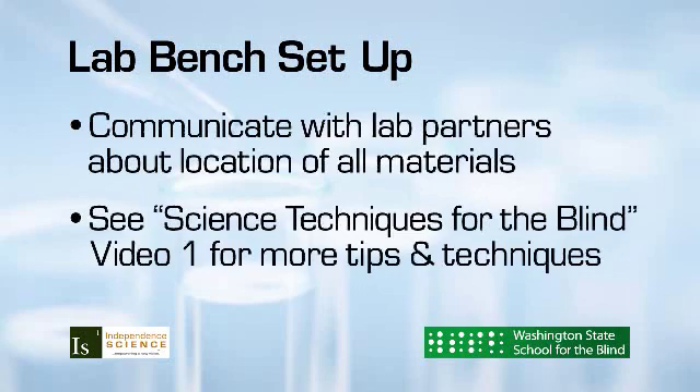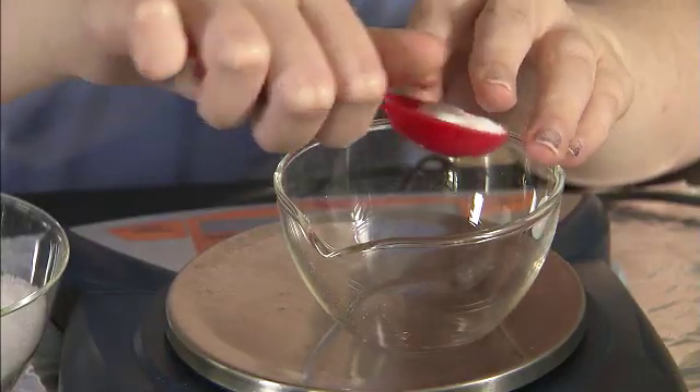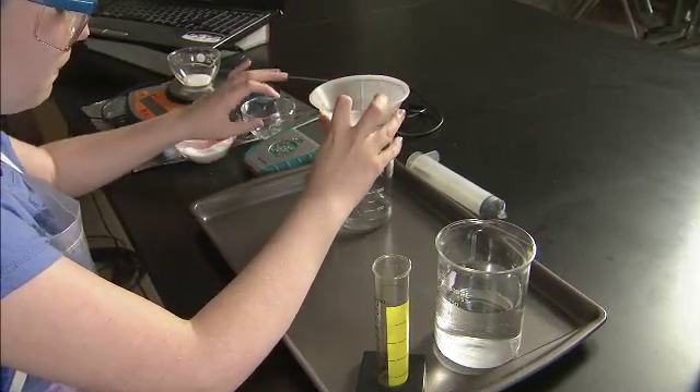Please refer to our first video, How to Safely Organize and Set Up a Lab Bench, for detailed tips and techniques. No matter what course you are in, virtually every experiment will include the measuring and transferring of liquids and solids between containers. A wide mouth container reduces the probability of spills. Pouring or scooping into a wide mouth container is easier for the student, but when a graduated cylinder or small beaker is required, a funnel should be used.